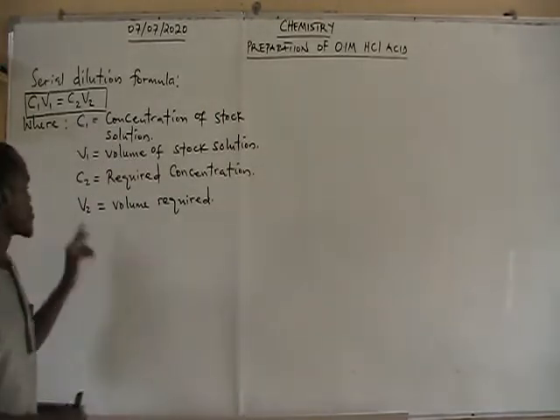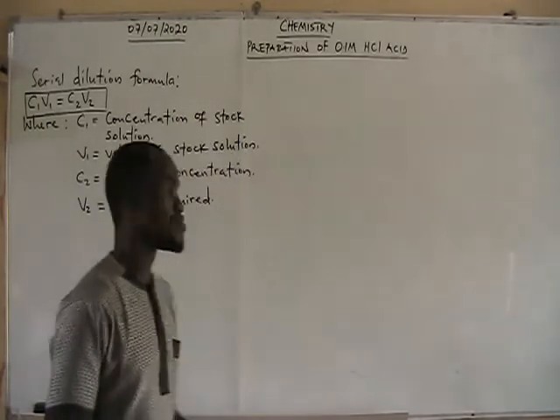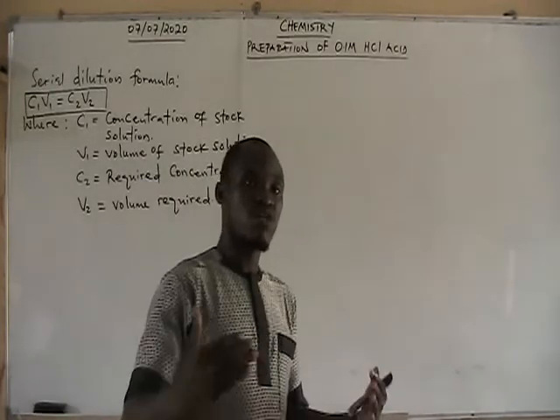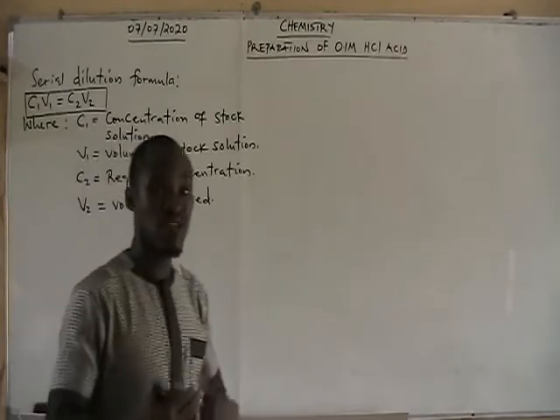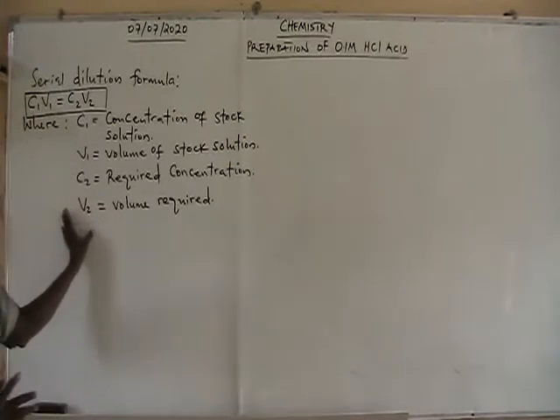If you want to prepare, for example, 1,000 cm3 of solution, you use the 1,000 volumetric flask, in line with your V2, because after you dilute the acid in distilled water, it gives you the required volume.